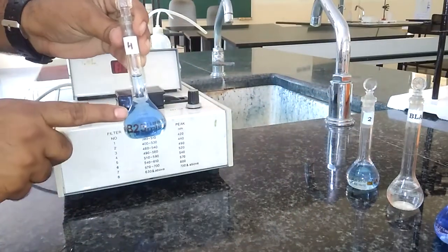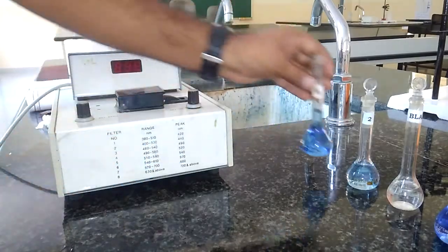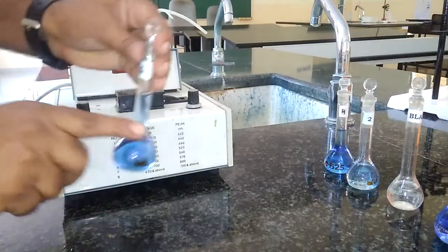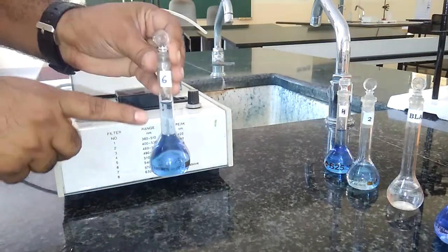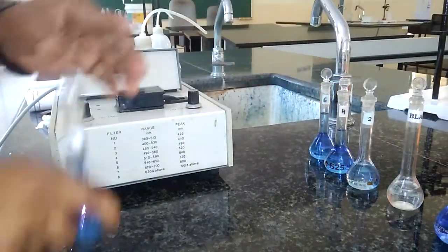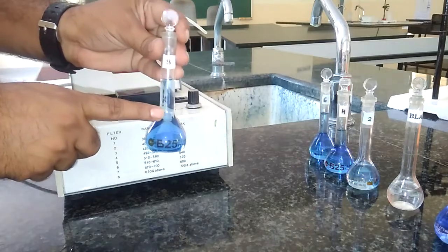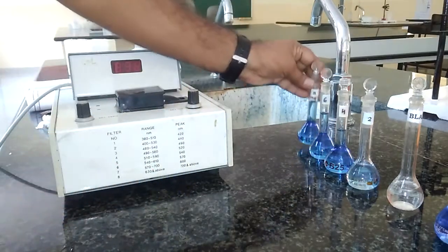For the second standard: 4 ml of copper sulfate, then 2.5 ml of ammonia as a coloring or complexing agent, then rest is distilled water, make up to the mark. Similarly, for the third: 6 ml of copper sulfate, then 2.5 ml of ammonia, then rest is distilled water. For the fourth: 8 ml of copper sulfate, then 2.5 ml of ammonia, then rest is distilled water.